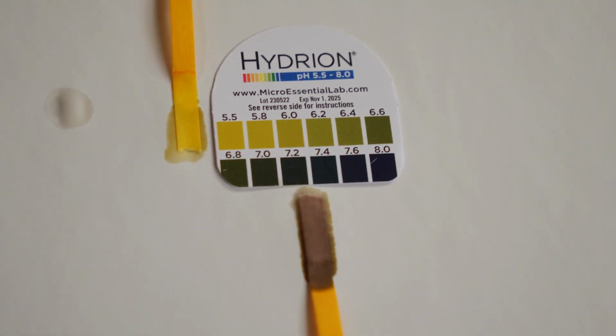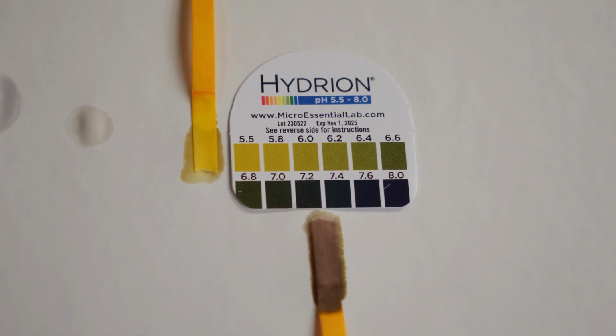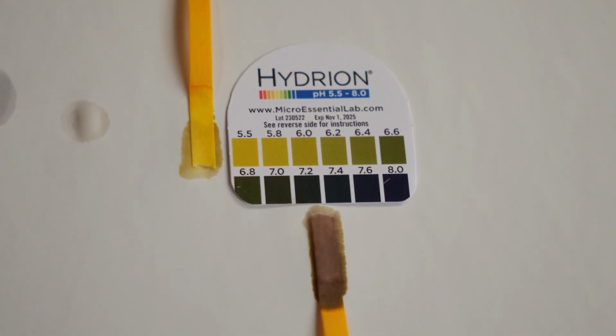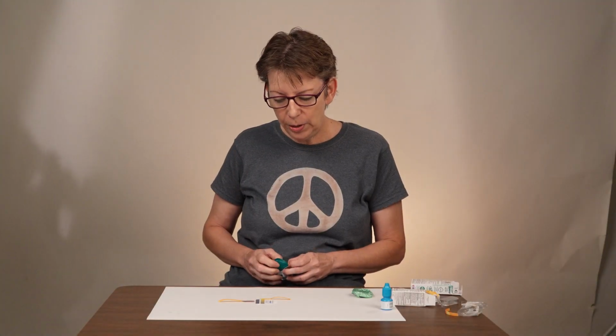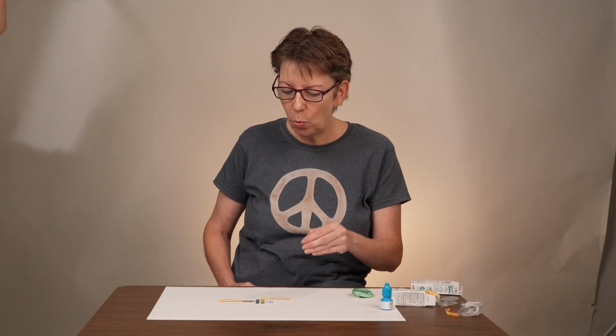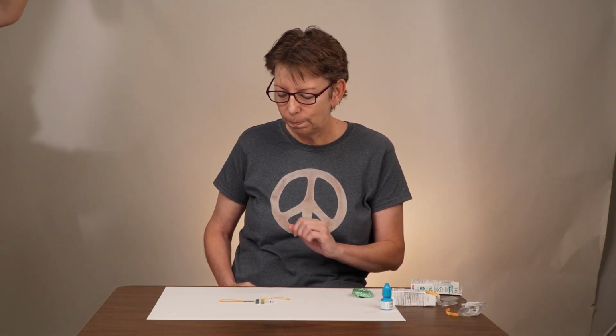All right, that's a long, long way from neutral pH. So if you're putting that in your eyes and it's stinging, I don't think you should be surprised. And an eye drop with that pH is going to be irritating to the front surface of your eye. You have a lot of other options, and there's just no reason to use a product over the counter with that low of a pH. Low pH means it's more acidic, and that is why it stings. So shop around. Do better for yourself.